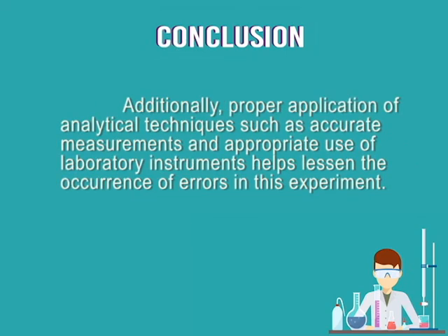Additionally, proper application of analytical techniques such as accurate measurements and appropriate use of laboratory instruments helps lessen the occurrence of errors in the experiment.